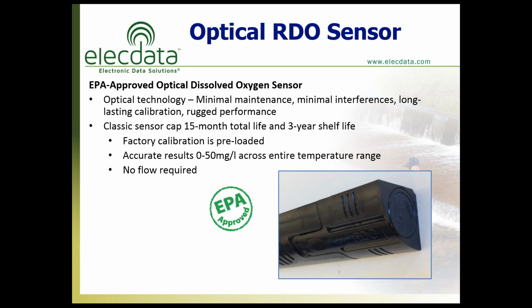They do have a 3-year shelf life, so if you have a budget and you're acquiring some materials with end of year money, you can buy a few of these and put those on the shelf. And again, the whole reason for doing this is to make sure you have the most accurate data possible. Because of conditions with shining an LED on the back side of that sensing material and then possibly having exposure from UV rays from the sun on the other side, this material on any DO sensor will decay over time.